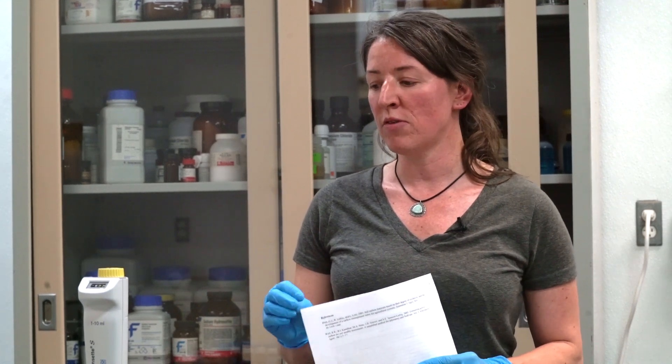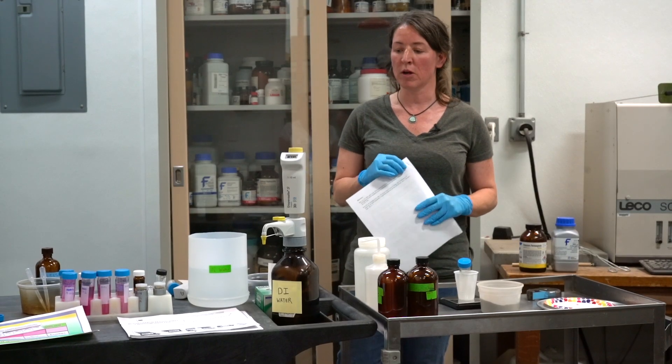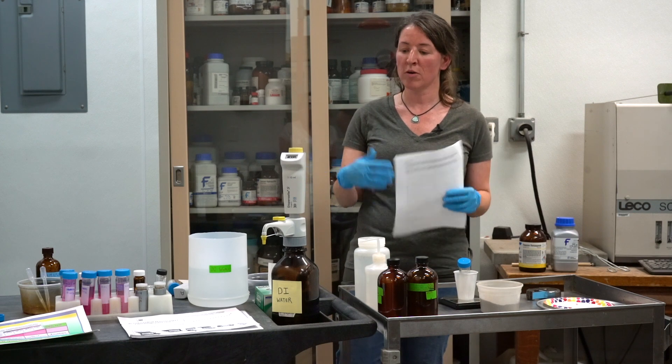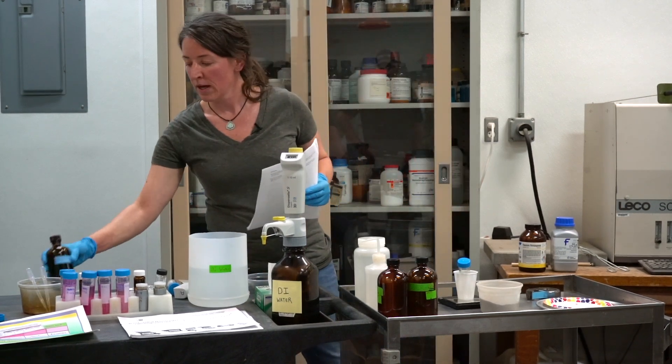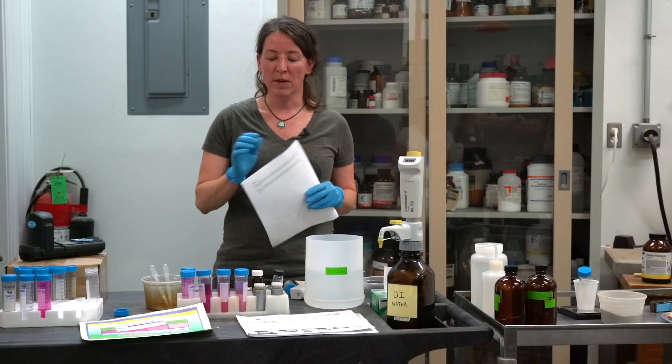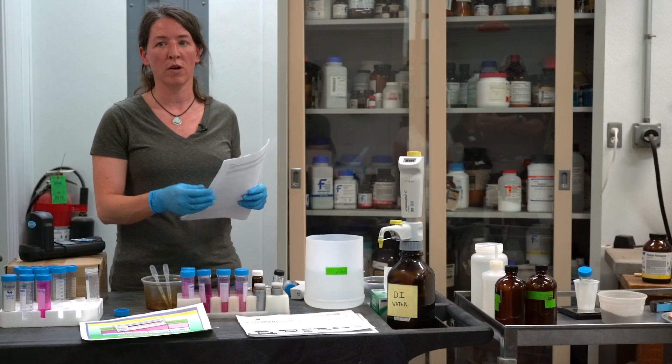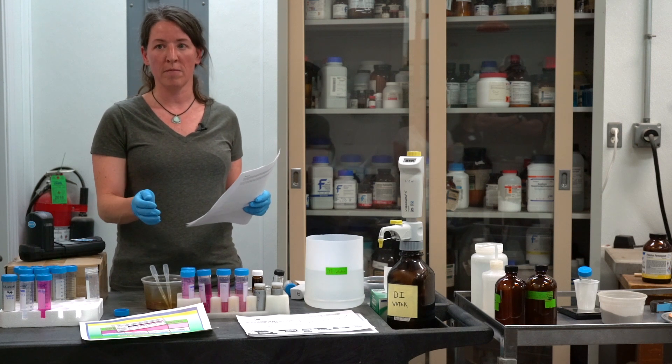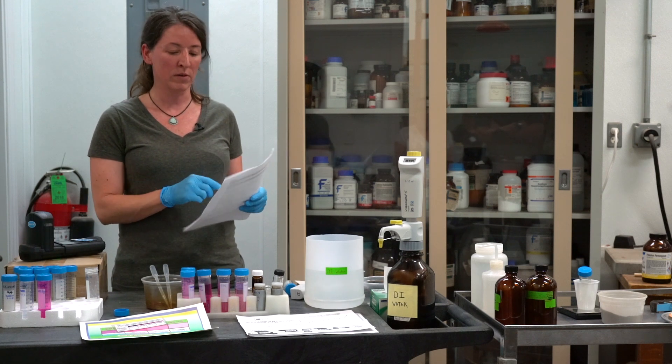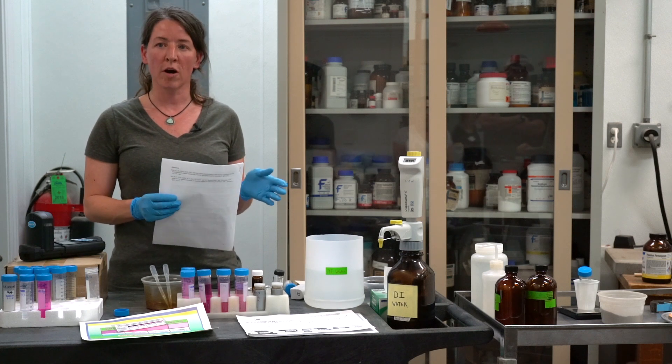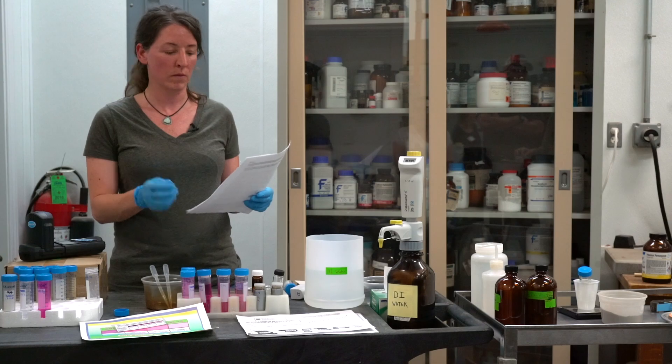When we're using potassium permanganate to analyze active carbon, we're actually measuring oxidizable carbon but it's closely related to the active carbon pool. The permanganate is a strong oxidizer and it reacts with the carbon in the soil. We're measuring the amount of permanganate that is reduced in the soil as it oxidizes carbon, and through the equation we can generate active carbon in milligrams per kilogram.